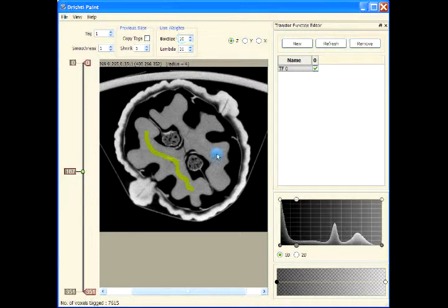So if I use 10 and then press T, say 20, and press T, and so on. Typically 5 does a good job, but sometimes you might have to fiddle with these parameters to get the required segmentation. Typically using these parameters, if you can detect the boundary, then you can segment the object.